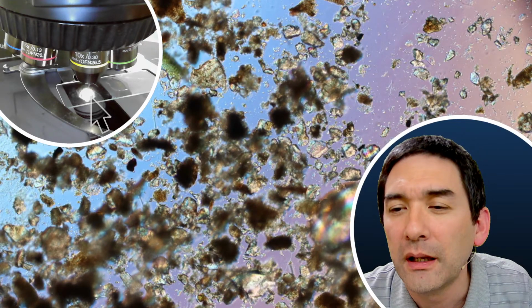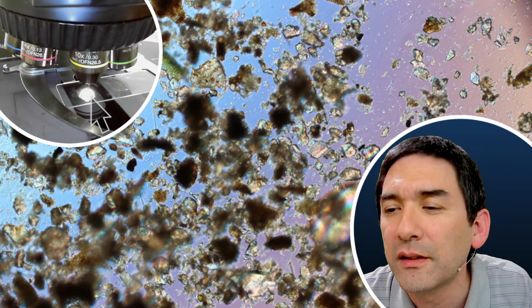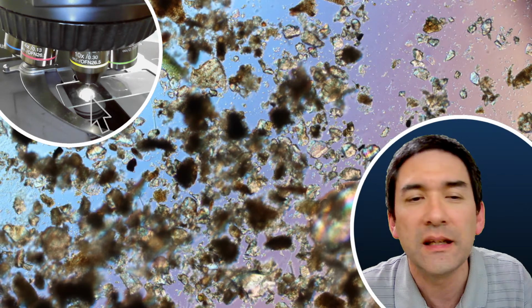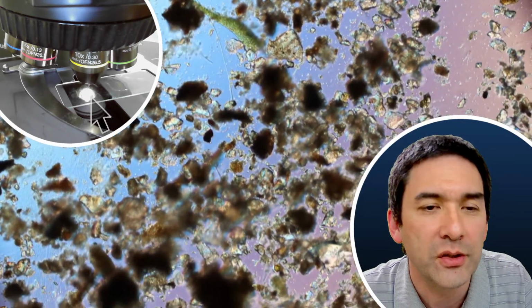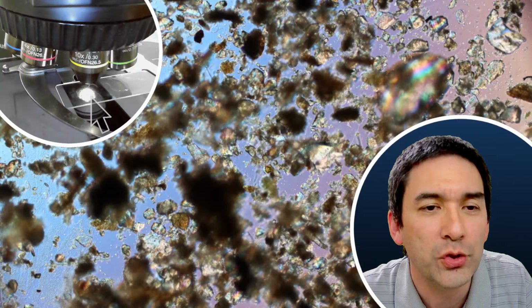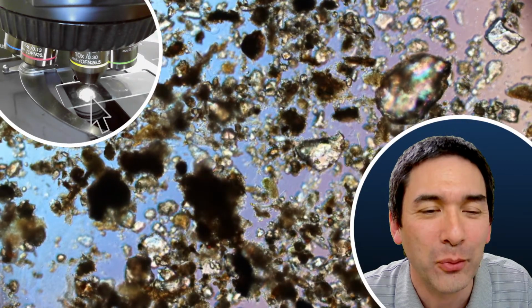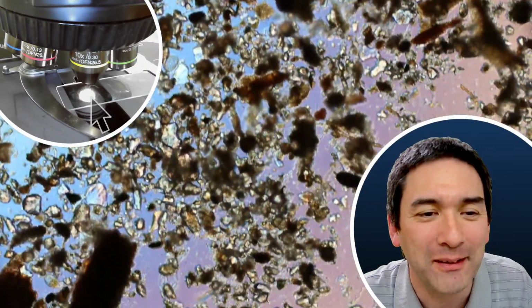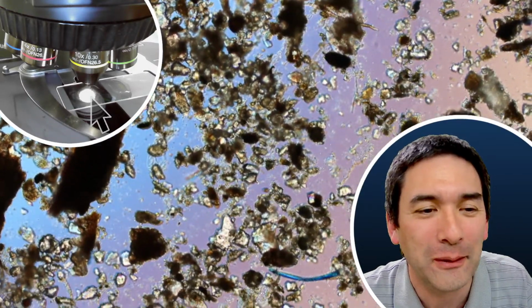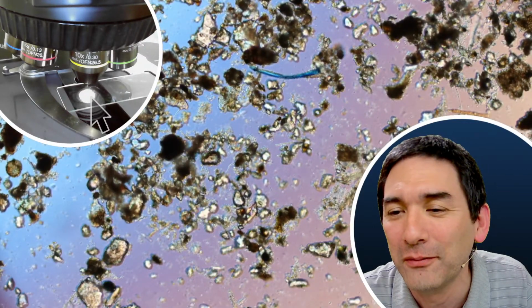Yeah, and I like to find tardigrades and observe them as they survive, as they revive out of the tun state. And I'm going to show you a video of a reviving tardigrade. I did prepare that as an emergency backup, because I was kind of worried already that something like this might happen, which is really typical.